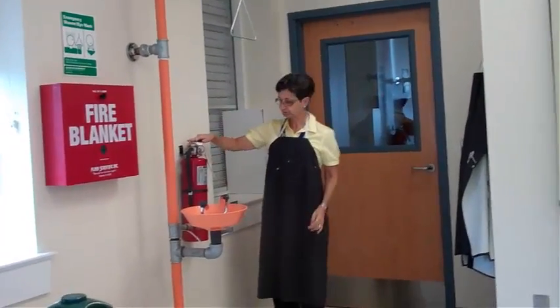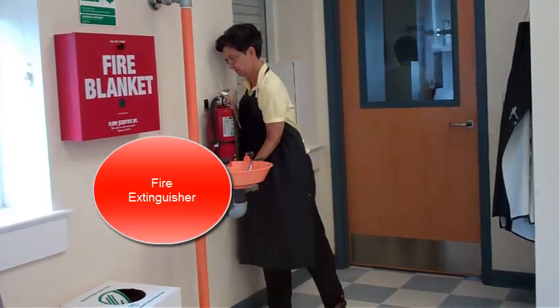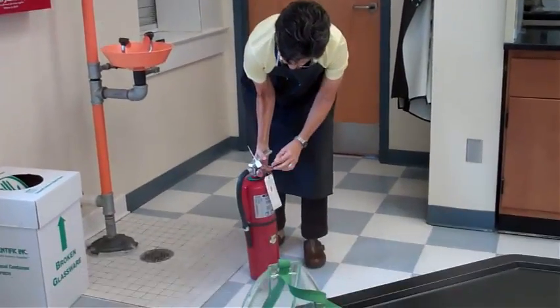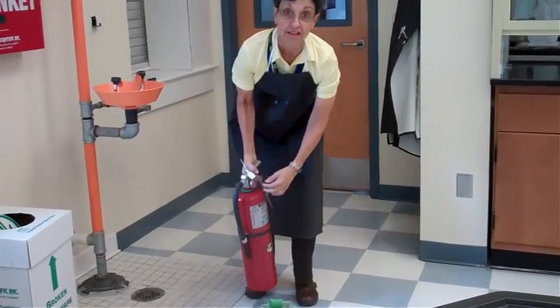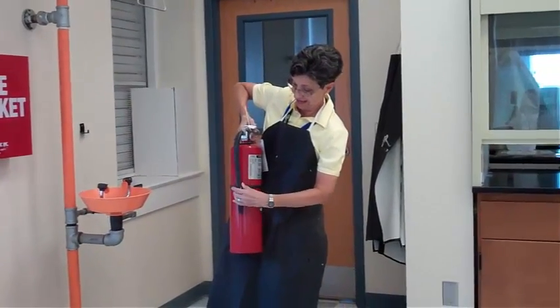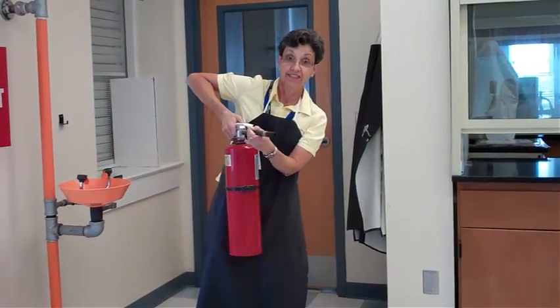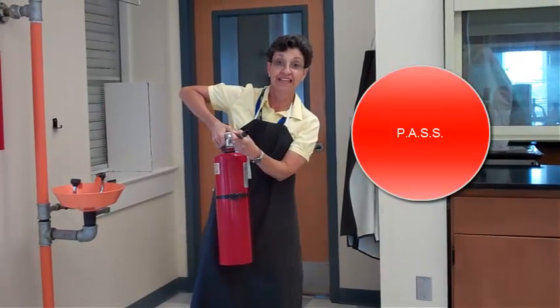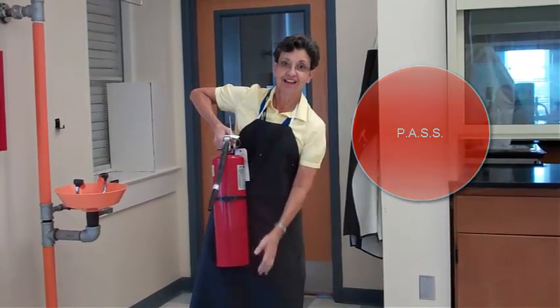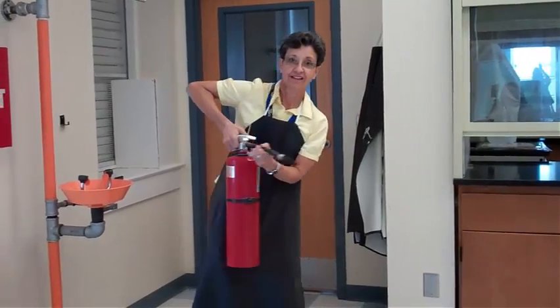Over here we have the fire extinguisher. The fire extinguisher comes off the hook. You are going to pull the pin — there's a pin right here. You pull it, you aim towards the base of the fire, and you squeeze. Then you spray like this. P-A-S-S: Pull, Aim, Squeeze, and Sweep.